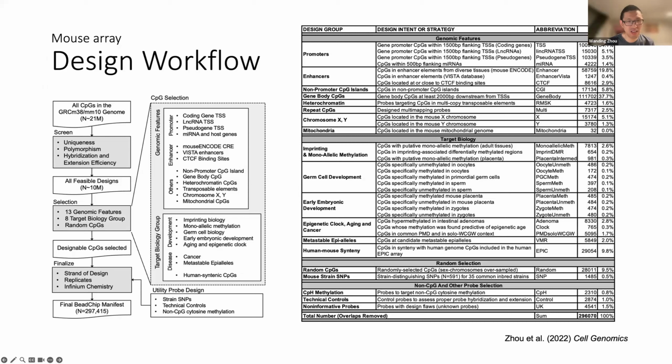If I were to have any suggestion for myself, I would reiterate the gap where I see, for example, platform-specific measurement variations. I think those need to be discriminated from the real biology.